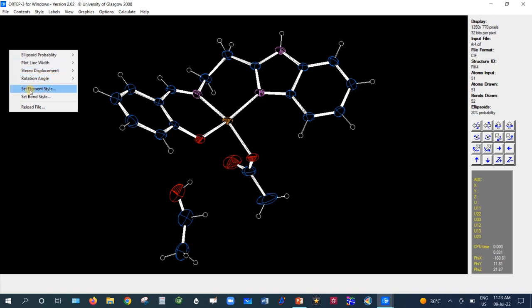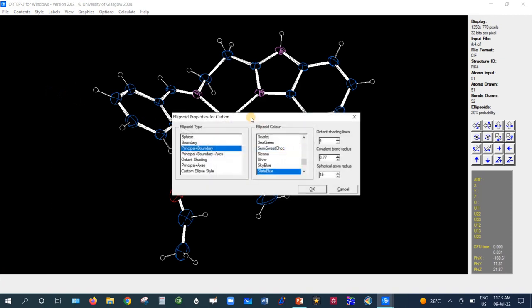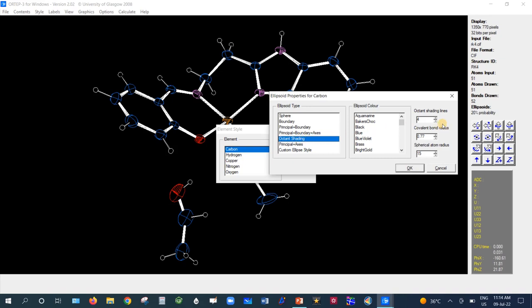There is an option called Set Element Style where you can set the style of each element. For carbon, suppose you want a color other than blue — you can change it from this window. There are several display options: sphere, boundary, principal plus boundary. Normally we take octane shading, where the shading lines are typically four but can be increased to six or eight. Then press OK.